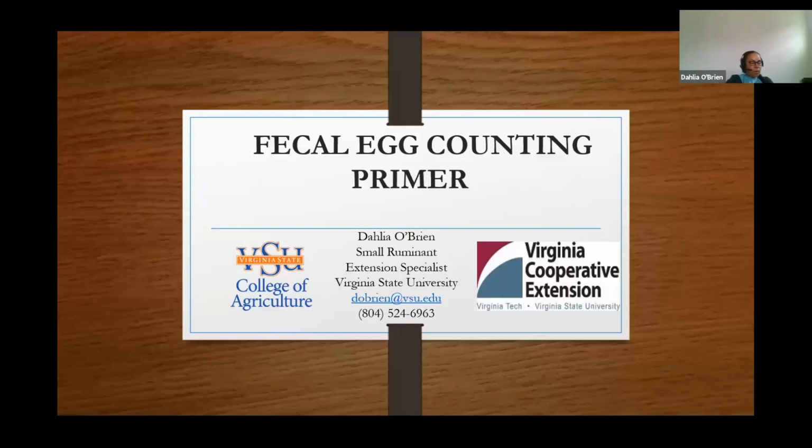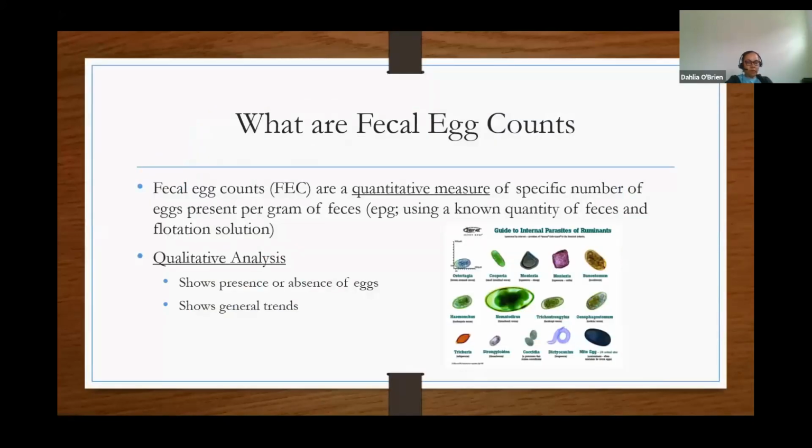Hello, everyone, and thank you for joining us today. As Susan said, I'll be talking to you today about fecal egg counting, and we'll be going over why we do fecal egg counts and the steps in conducting a fecal egg count on your own if this is something that you're interested in. So first off, what are fecal egg counts?